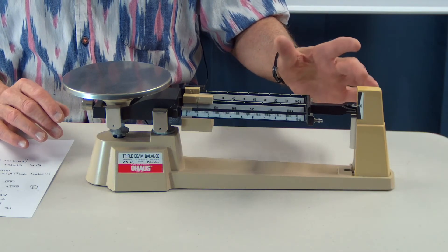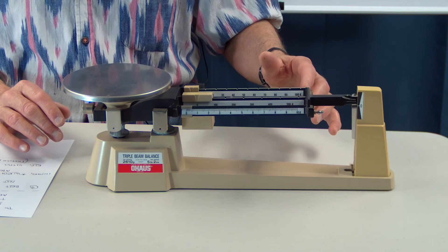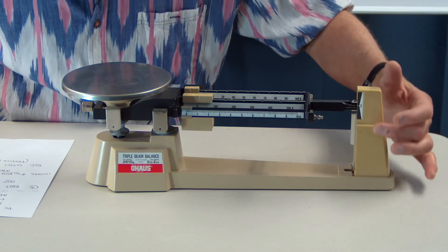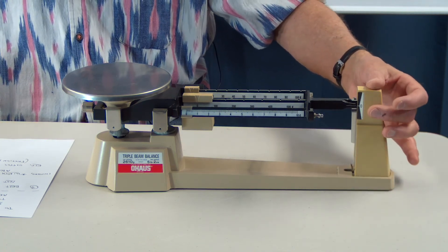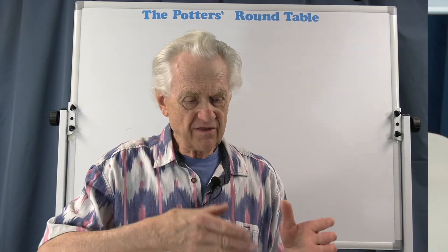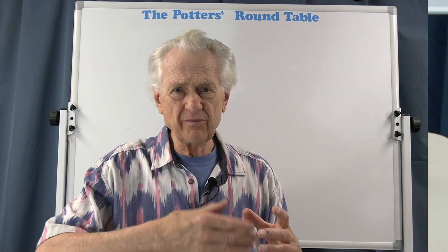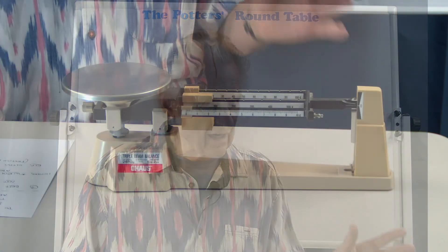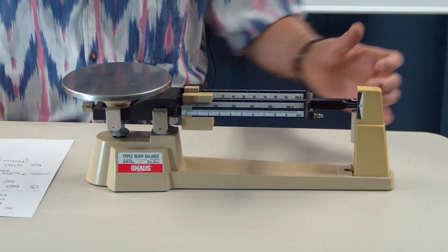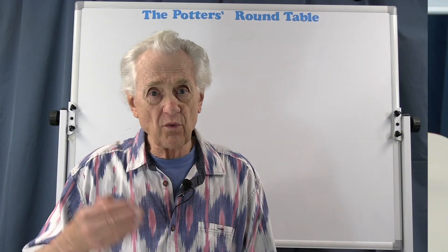It's more helpful to just let it swing and watch it go back and forth. When you've got it balanced, the swing above and below zero will be equal. By the way, this scale also has a magnetic damper — there's a magnet inside and the arm is made of aluminum. As the arm moves through the magnetic field, it slows down so it doesn't keep swinging forever. So when it goes up about the same distance above and below zero, that's it — you're balanced. You don't have to wait for it to come to rest.